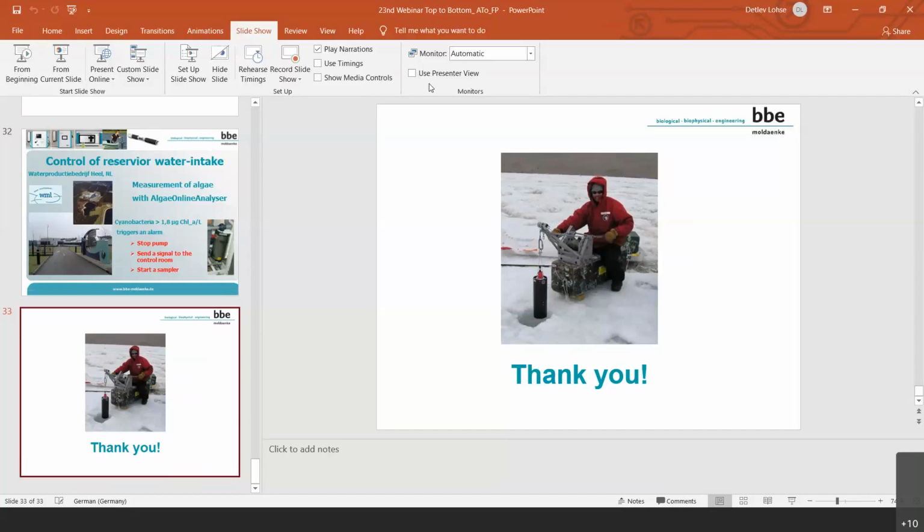No, that is not the same. You can use it, but it's really not the same. We call it FTU because we use the formazine. It depends on the angle, because we have the backscattering. The NTU usually is measured at a 90-degree angle.